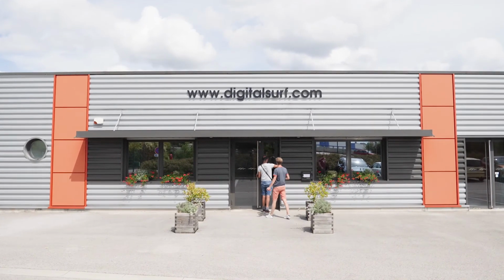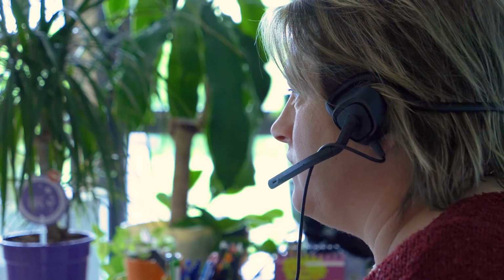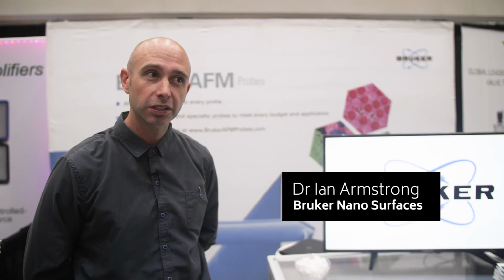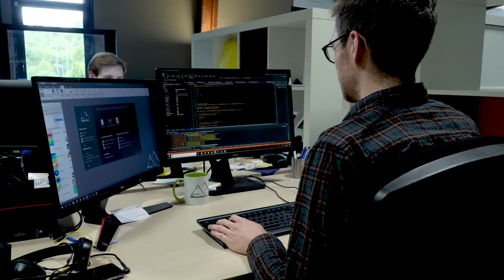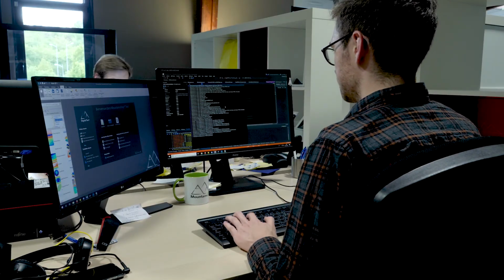I think the support from Digital Surf is great. We have a lot of different customers and they usually want something bespoke that's not in any available analysis software. So the turnaround time to get a new feature or report something that could be of use to a lot of people is very good.